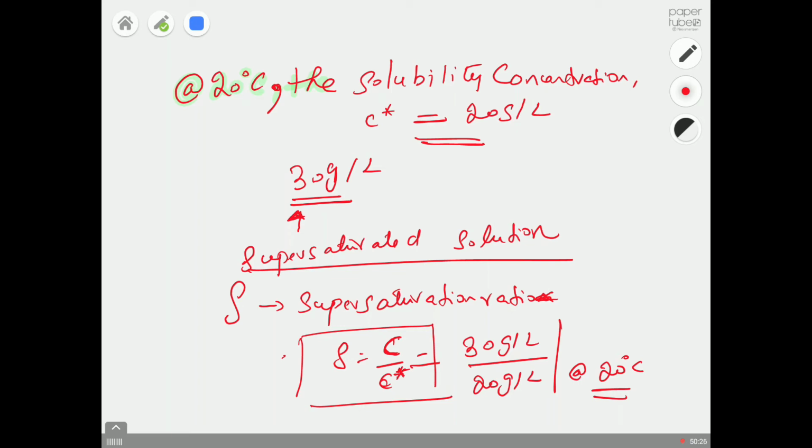I might even ask in the final exam, like, I need to crystallize some compound at 20 degrees centigrade, and that's the solubility curve you have. Tell me the experimental procedure, how you are going to do that in the lab, or even in an industrial scale reactor. So you have to write something along that line. In the exam you might have a lot of open-ended questions, and this is one good question to ask. So try to remember how crystallization works, how to perform the experiment, and how to maximally exploit the solubility data.